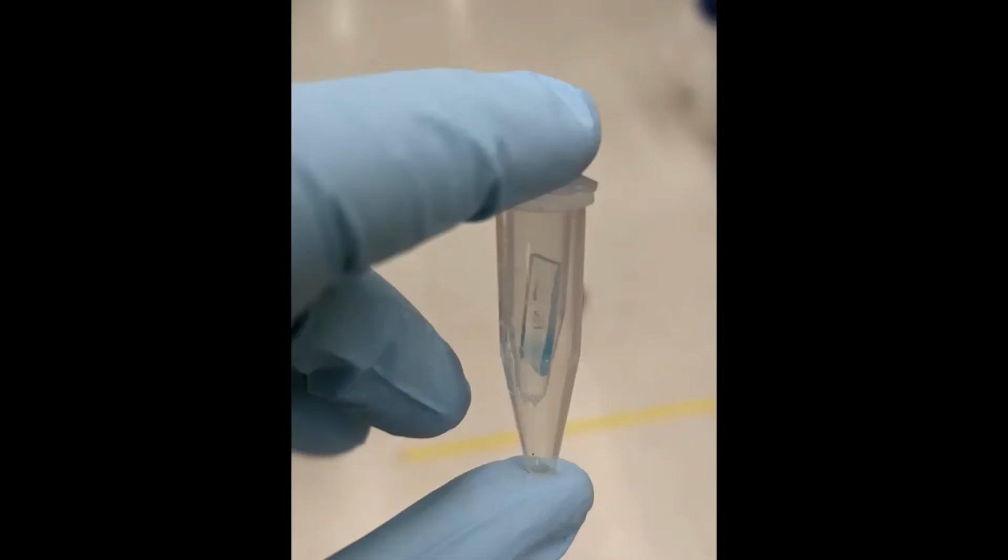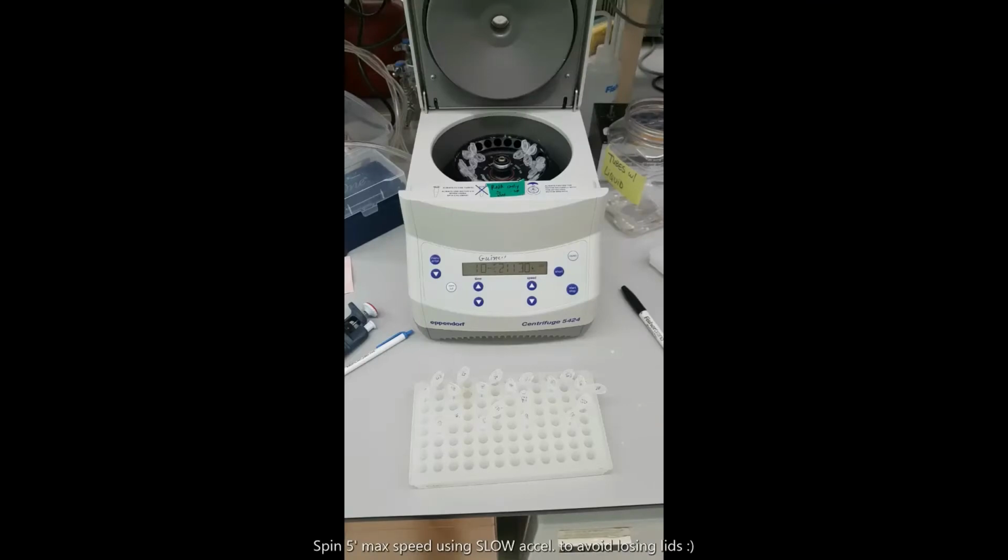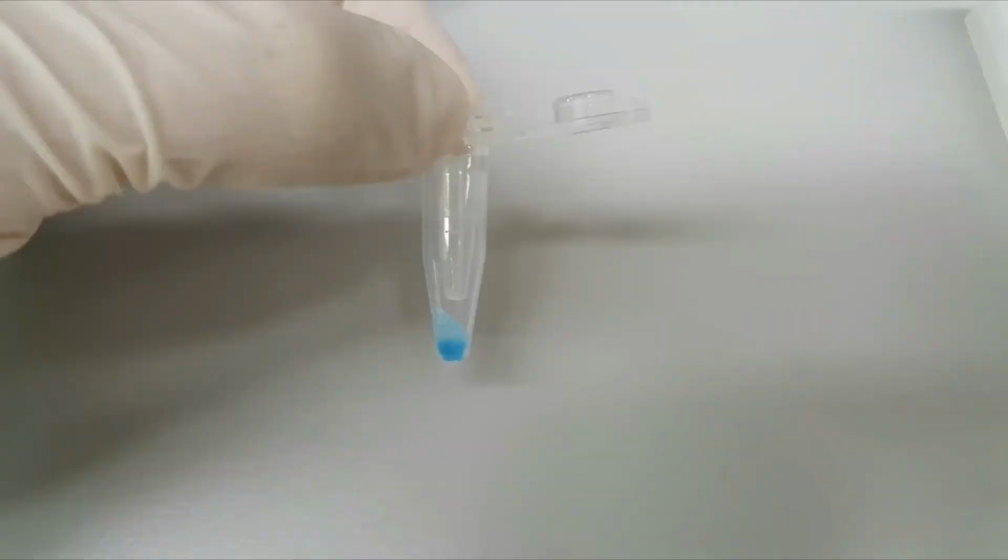To more efficiently elute our RNA, we will shred the cut gel slice. While shredder tubes are commercially available, you can also just take a 0.5 milliliter PCR tube and puncture it 3 to 4 times with a 20 gauge needle. Next, spin this setup for about 5 minutes at maximum speed. I would recommend to use an Eppendorf centrifuge with low acceleration to not lose the lids of the tubes. The gel should form a nice slurry at the bottom of the 1.5 milliliter tube.